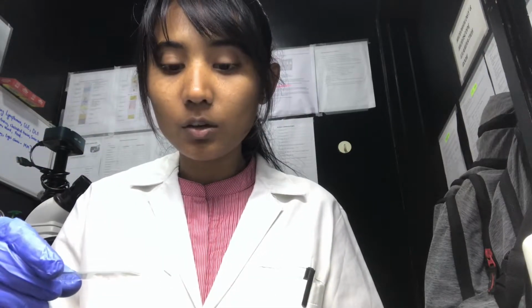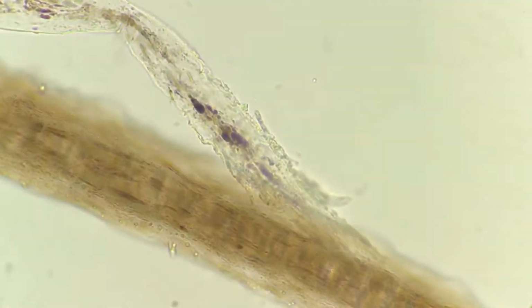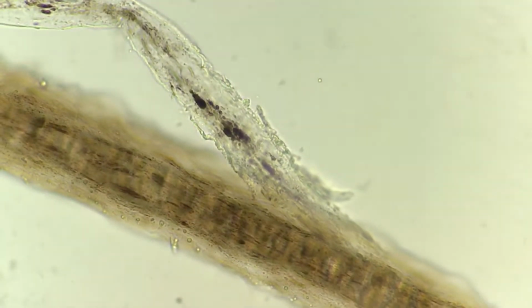That's it. Remove the excess potassium hydroxide with tissue paper and add a cover slip to examine it under the microscope. And this is how the hair looks after processing. Do not overheat, as your hairs might start to disintegrate.